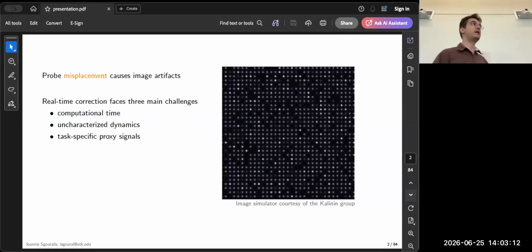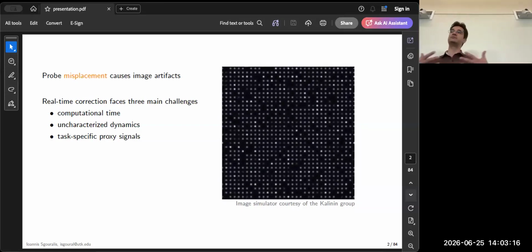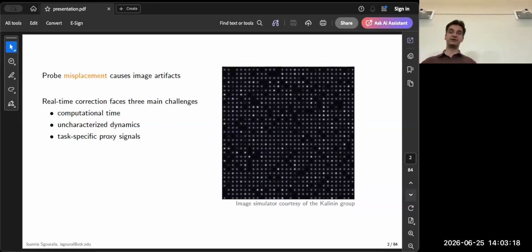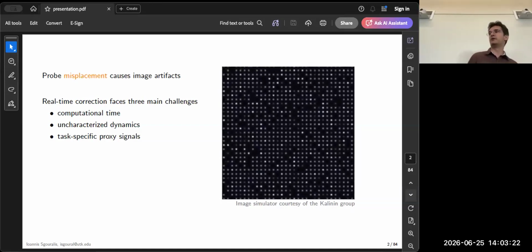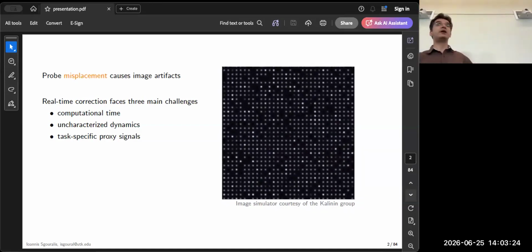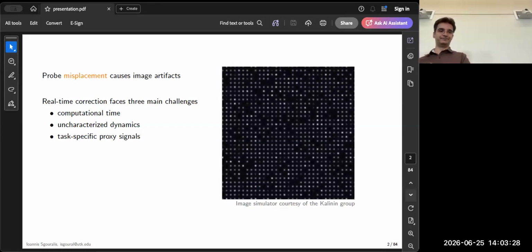So we set up the microscope to collect an image, the microscope does its best, and it gives back an image or a sequence of images that are the best that the microscope can do. As you can see in this case, we aim to image something static, but we get something that is moving.